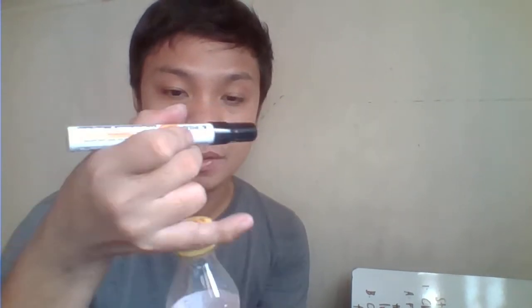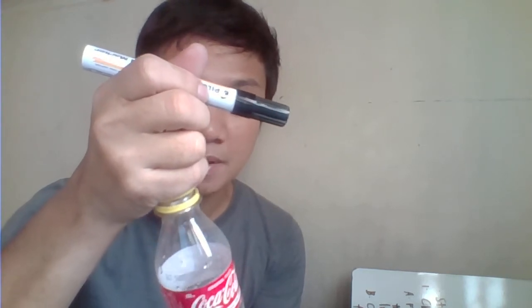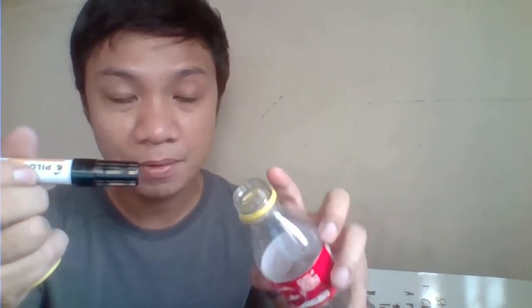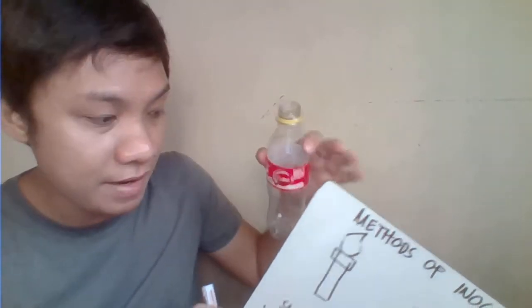Okay. So it can't be that you just open it any which way. With the hand holding your inoculating needle or loop, your little finger and index finger will twist it around. Then, before you get a sample, if this one contains your bacteria inoculum, flame it first. You pass the mouth of this one through the flame.